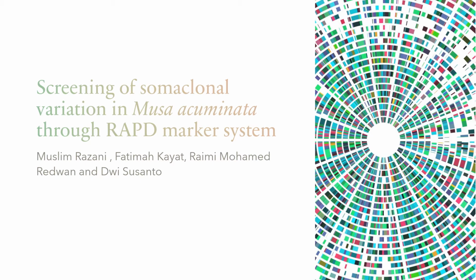In this presentation, I would like to share about screening of somaclonal variation in banana, Musa acuminata, through the RAPD marker system. This is taken from a publication by Muslim Razani et al.